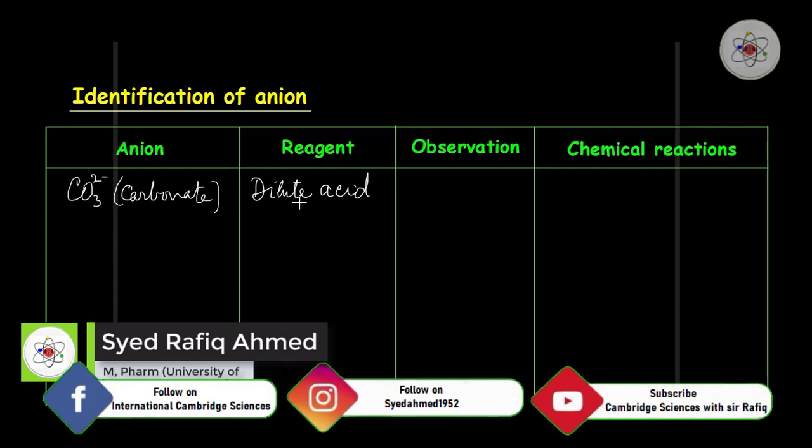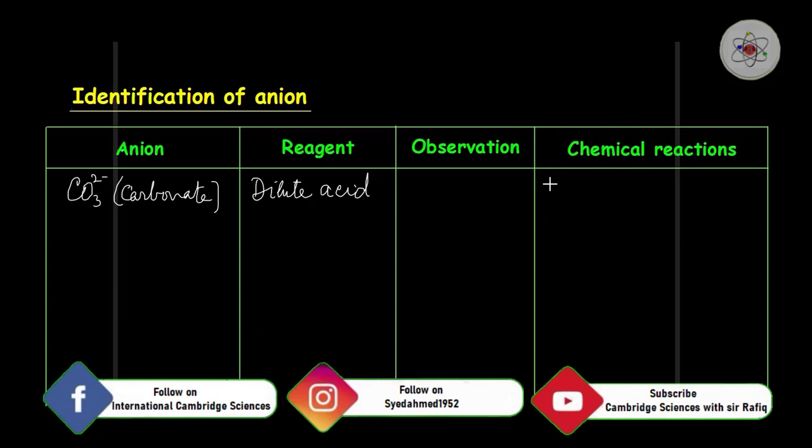What happens basically is the H+ ion of the acid reacts with carbonate, if the salt contains carbonate, and forms water and carbon dioxide. So carbon dioxide is observed as fizzing or effervescence, right? If you are asked to test the gas produced, obviously you will go for the lime water test, which turns cloudy.